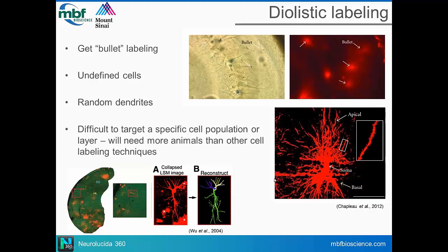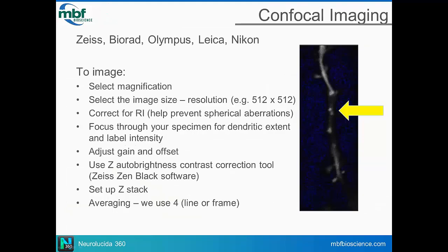True. So the next step then is once you have your tissue, you've got to digitize it. You got to get some good images. Right. So you have to image your tissue, and this is a big problem I've seen in the field. When I see some papers and they show these oversaturated images of neurons and dendrites, and they tell me a spine density, I kind of look and I think, how do you know? Because you've oversaturated your image, and I don't necessarily believe the data there.